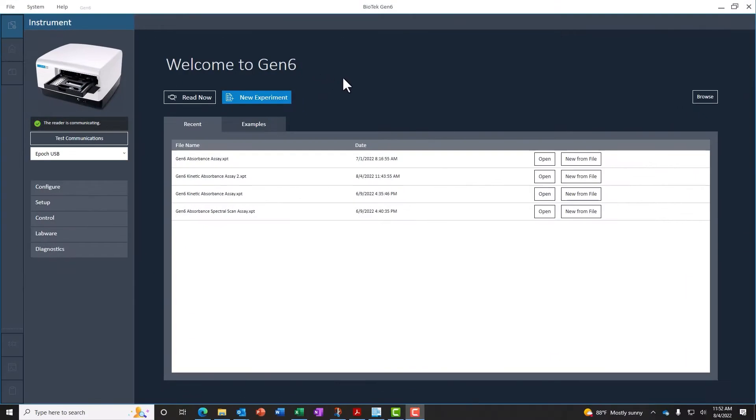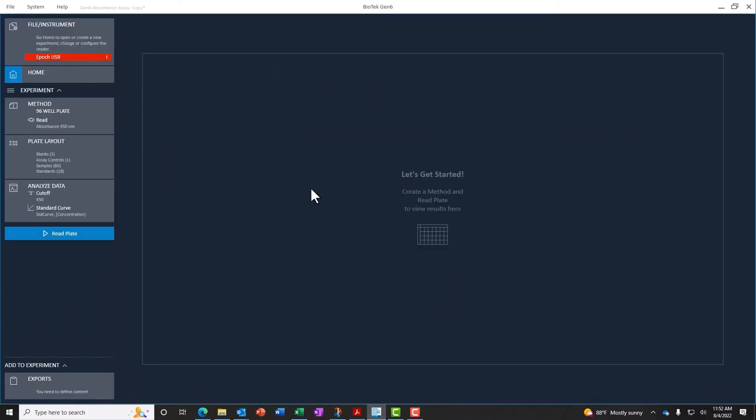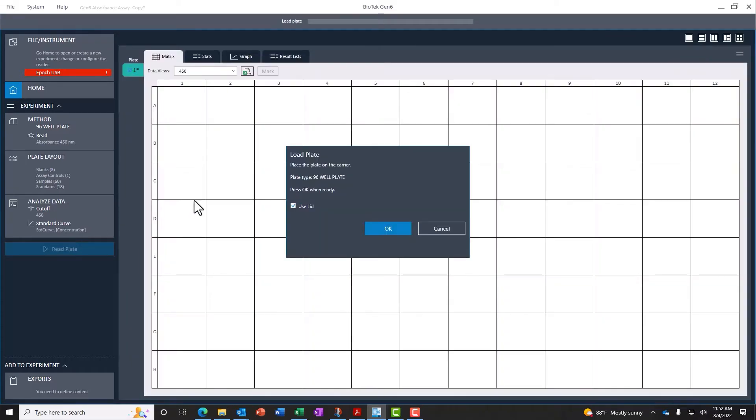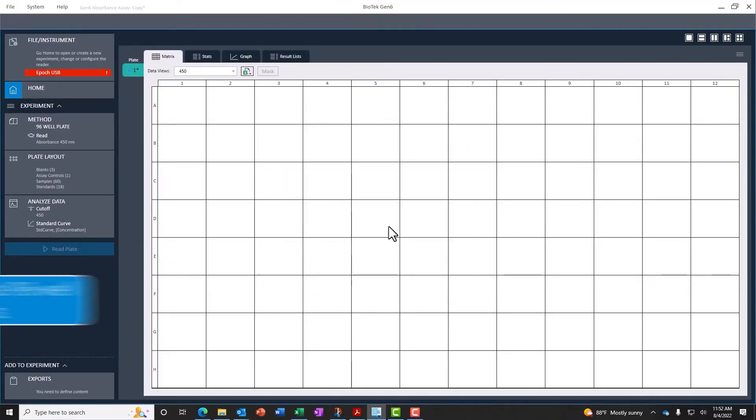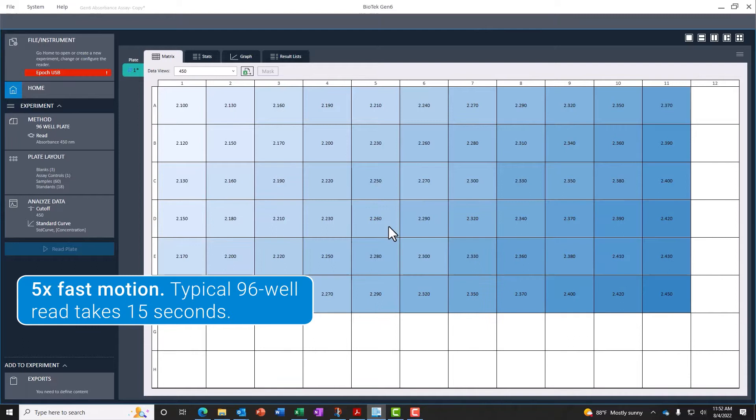Epic offers simple assay setup in Biotech Gen 6 software, including a range of common protocols pre-built into the software, allowing walk-up functionality for both new and experienced users alike.